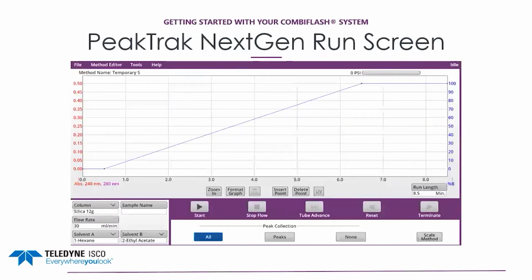This is the default start screen. Everything on the CombiFlash system can be run from either this screen or the method editor screen. The first step is to load or choose a column so the gradient optimizer can use the correct parameters based on the column size.